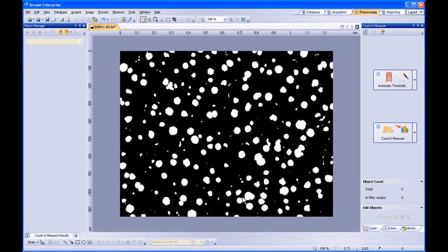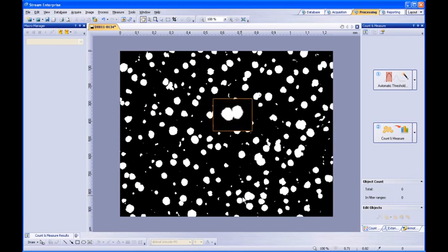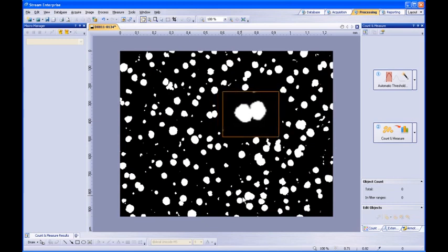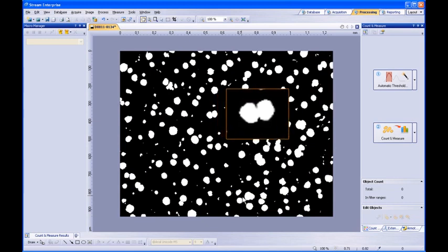After the binarization has been completed, you may notice that some neighboring particles may be touching. Unfortunately, these particles may be inaccurately counted as one during the particle detection. Therefore, a morphological filter can be applied which will automatically separate each of these touching particles.